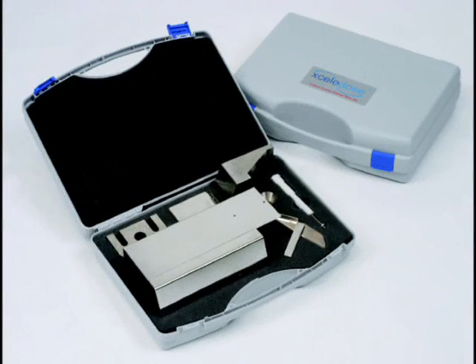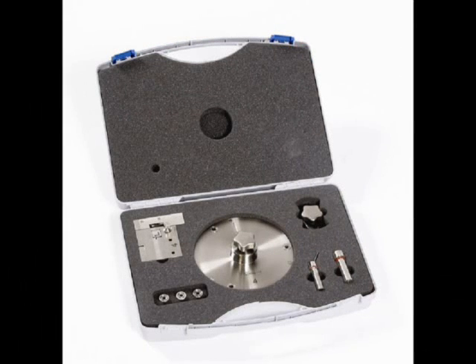Parts of the Accelidose 120S system can be changed so different capsule sizes or other small dose containers can be used. For example, cassettes, vials, tubes or blisters.